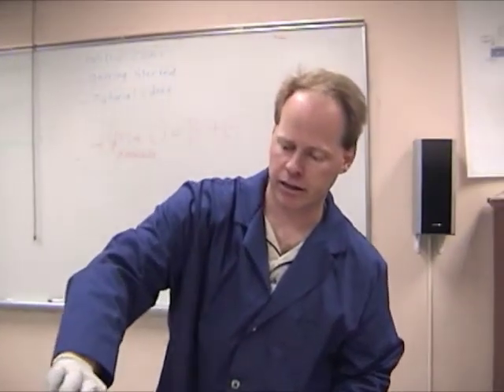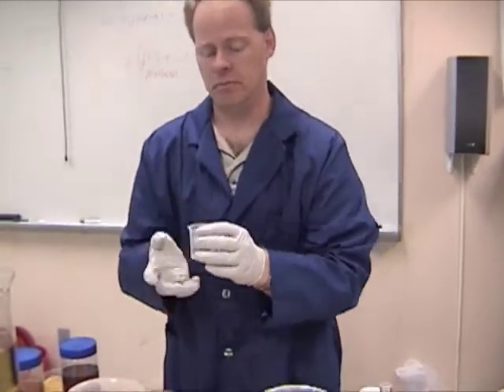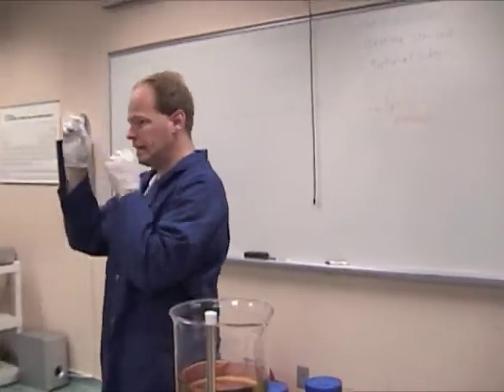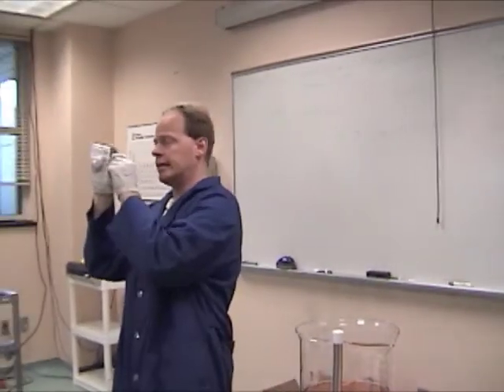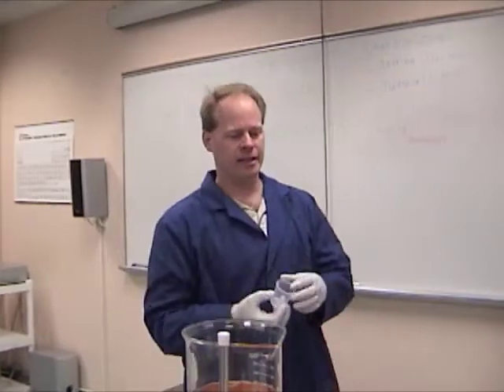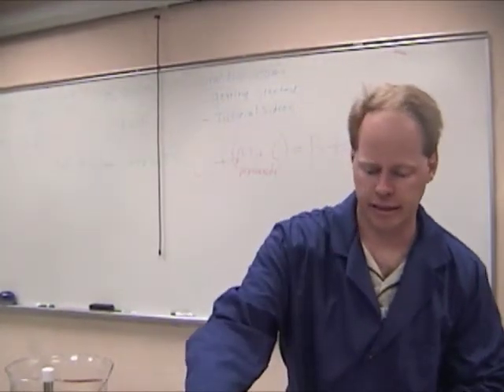So I'm going to take this and put it in here. I don't know if you can see this, but moisture is already eating away this catalyst. I had a little tiny drop of it, and it's already turning to water. That's how quick this stuff will go bad if you leave it open in the air. So we're going to let this stir for a minute.